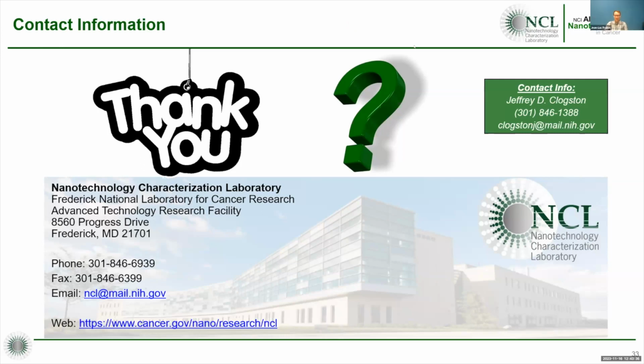You said you can just apply with a white paper, right, to have your formulations tested. Is that right? That's correct. There's more to it than just applying, and you can check our website for details. Basically, you have to have an application or indication for cancer therapeutics, so you have to show demonstrated efficacy in a biological system. Obviously, have physical chemical characterization, things like that. But yes, it's an open, free process, and if you're accepted, all of this is free for you. Oh, that's cool. All right, thank you.